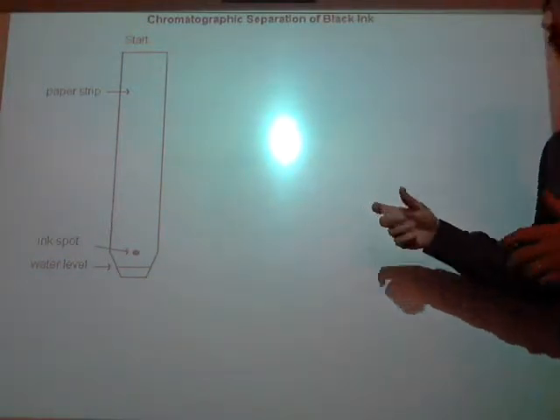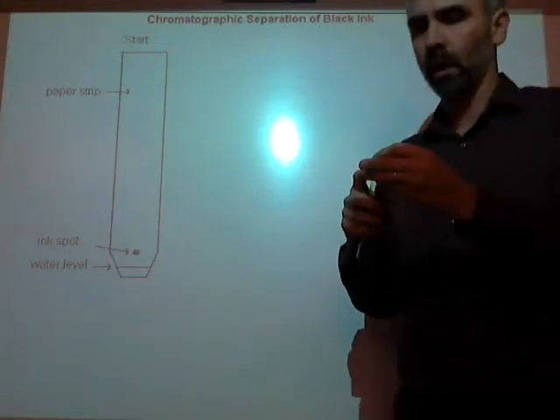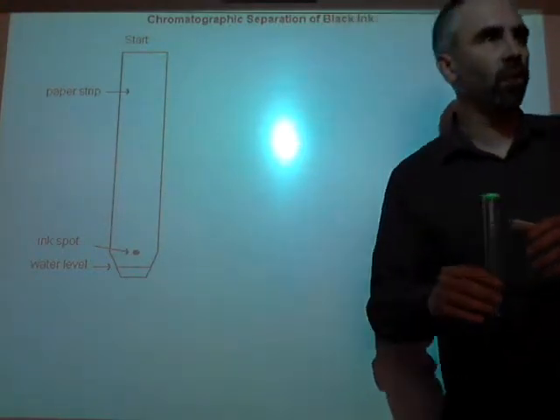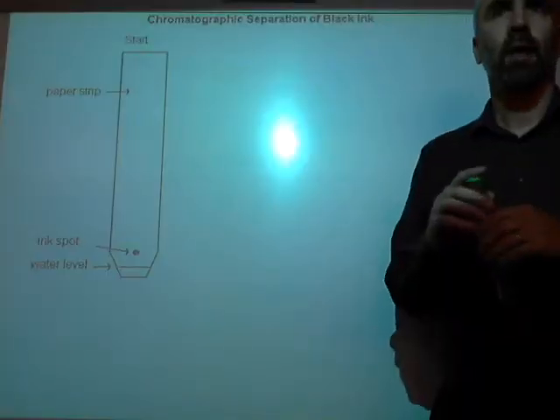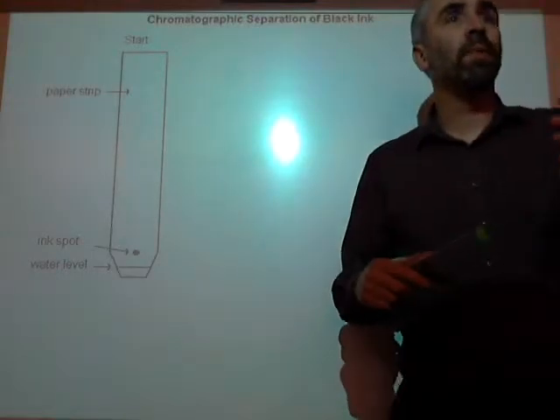All right, what will happen is you put that in here, you put the lid on it, and you're going to let it sit. Now, it's going to take about an hour to do this. That's why we're going to do this lab first, in our double period. And while we're waiting for this to be done, we'll do the other lab. You're going to have a lot of time in this double period tomorrow. You're going to actually use all of it because you're going to have to finish up the other classes.